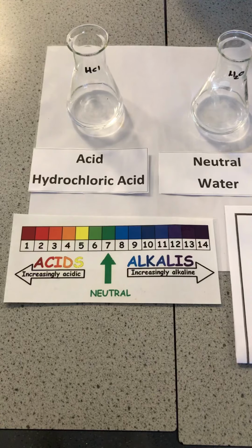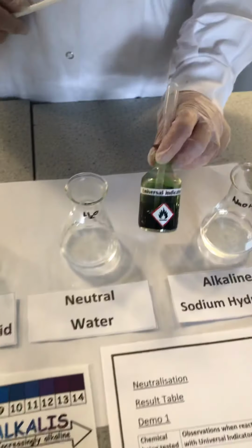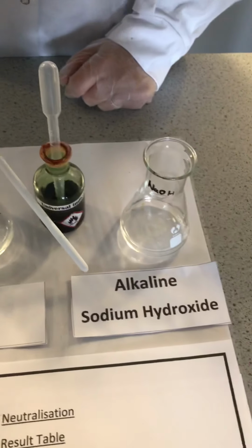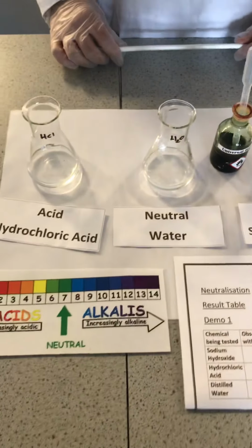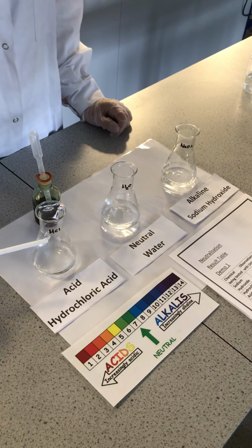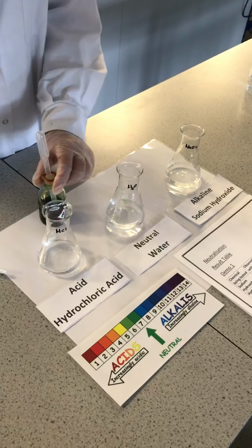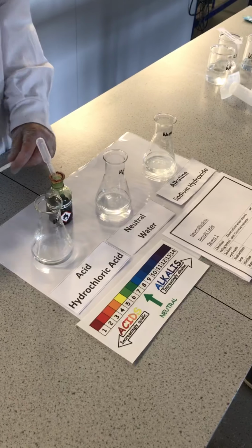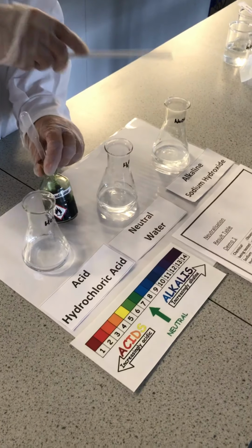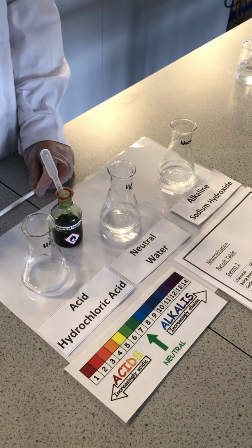Before we show you how neutralization is done, we will show you the color change by adding an indicator to an acid, water, and alkali, and observe the change in color. We have 3 different conical flasks labeled acid, water, and alkali, and universal indicator to test them. We will add universal indicator to all 3 liquids, see the color change, and identify which one is acid, alkali, and neutral using the pH chart.